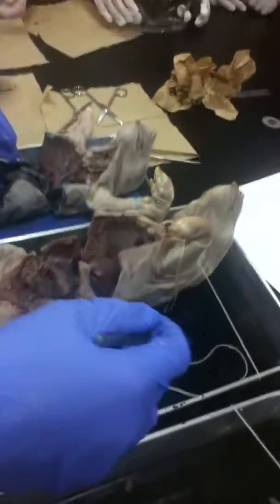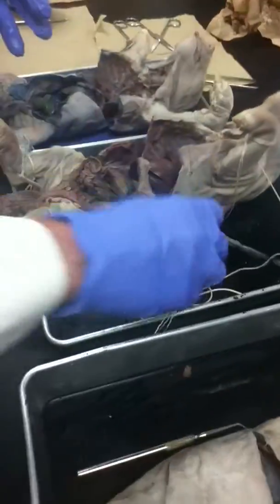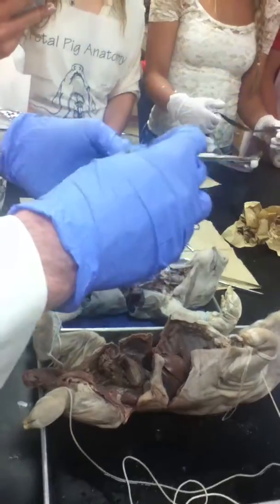Do they pump something into the heart to keep its shape? Or like, what is all that? Just the preservatives and all that. What is like the dye? Because it's like hard. It's latex. Okay. It's liquid, well, latex, and then it hardens. Okay. Yeah. Okay.